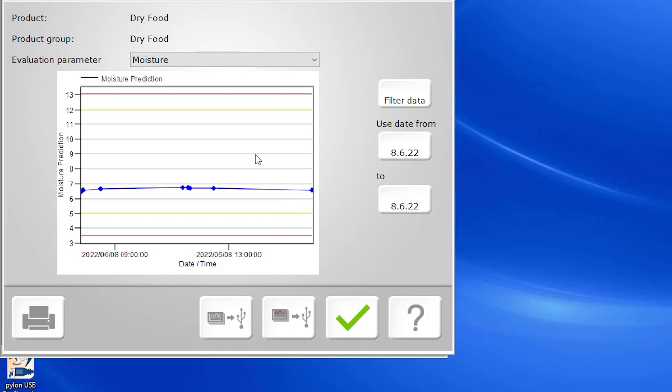As we can see here, from the multitude of dog food samples that we've scanned, the tango is giving us fantastic repeatability.